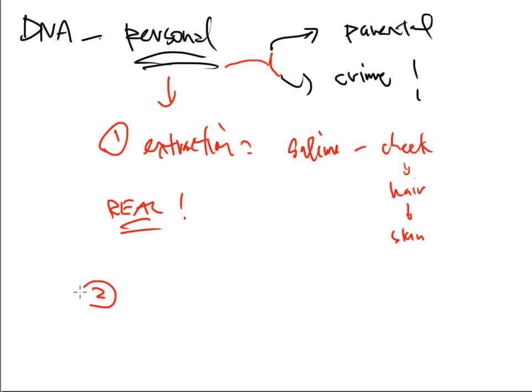The second part of this lab experiment is a real PCR finally. What you're seeing with the parent and the crime scene experiments is that a lot of times they've mentioned PCR and referred to the PCR process. In some cases, they've gone into more detail than the other one did. And that's okay, but they're at least saying, hey, remember, PCR is actually out there and it's getting done.